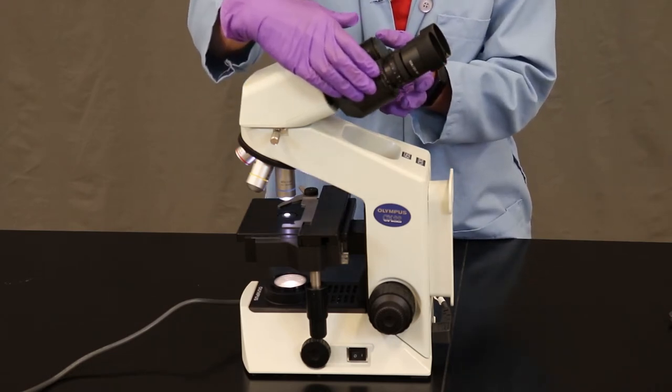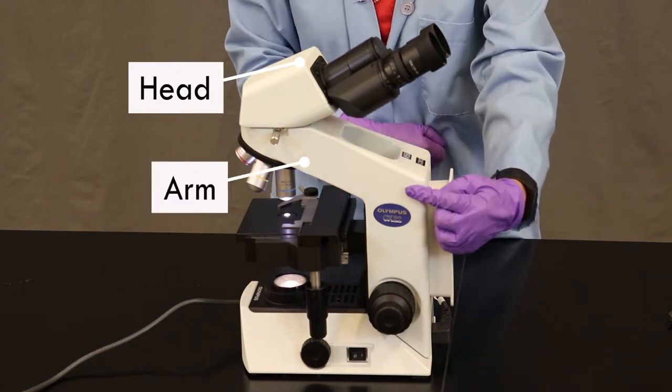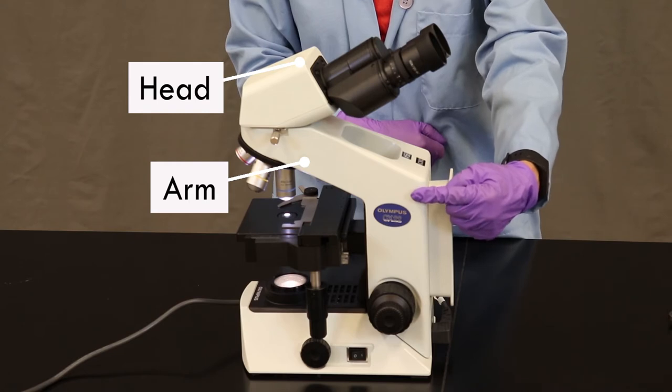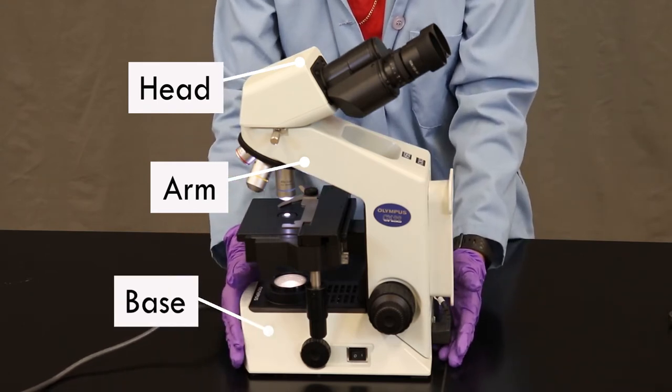This is the head of the microscope. This is the arm of the microscope that we help carry it by. And then we have the base of the microscope where it sits on the table.